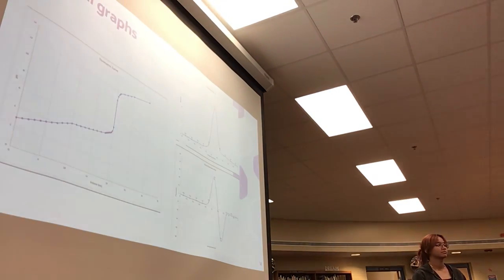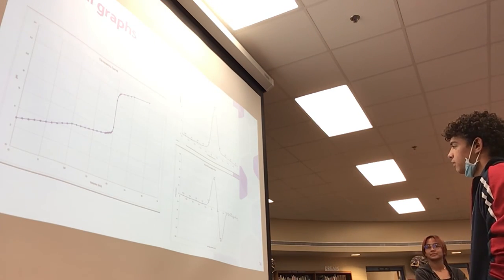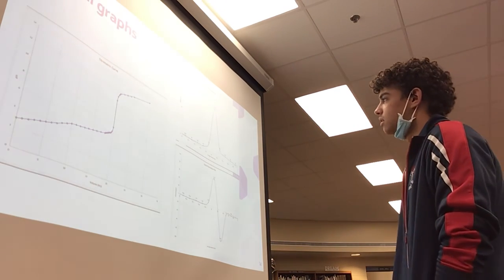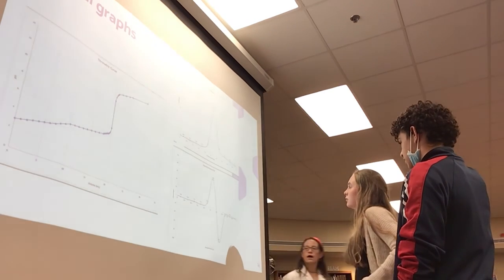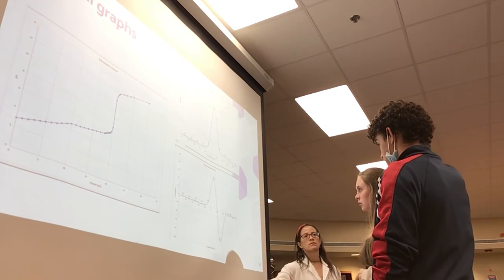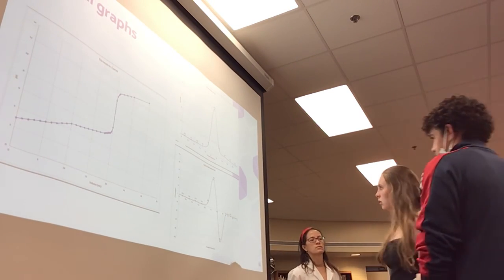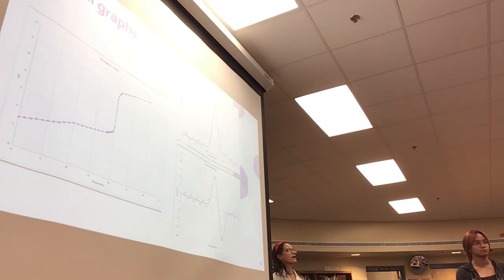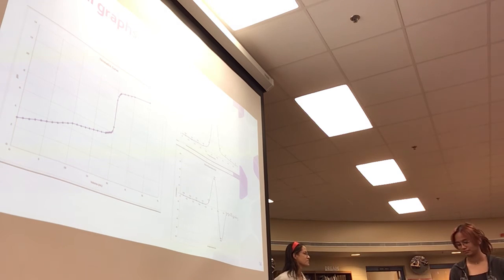Go back. I just want to see something. That was really good. I want to see what exactly they are measuring. What's your equivalence point measured in? The equivalence point in the second derivative is exactly the... No, I'm trying to see the units that they measure it in, because I'm just confused. It's measured in volume. Yes. X is the volume of the titrant. Okay. So we still have to do the math to find the actual value. Exactly. That's the idea. Okay. Thank you.